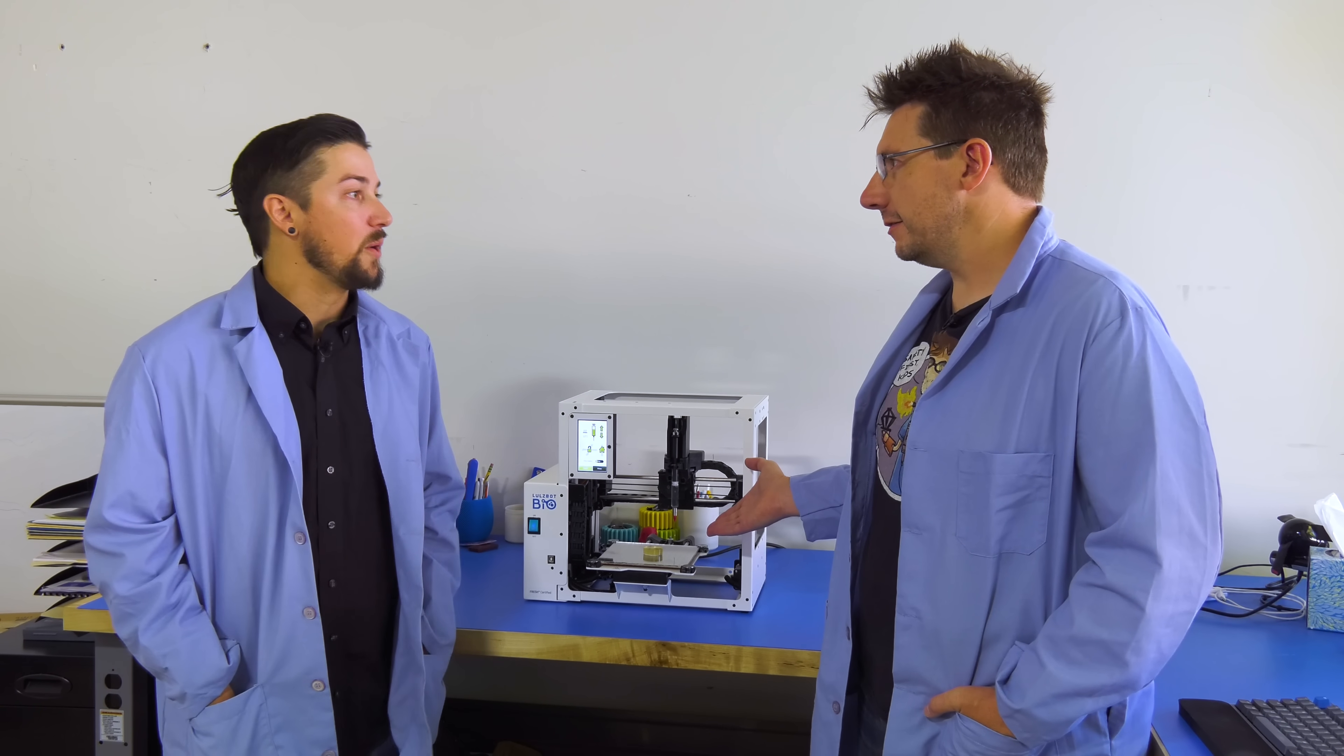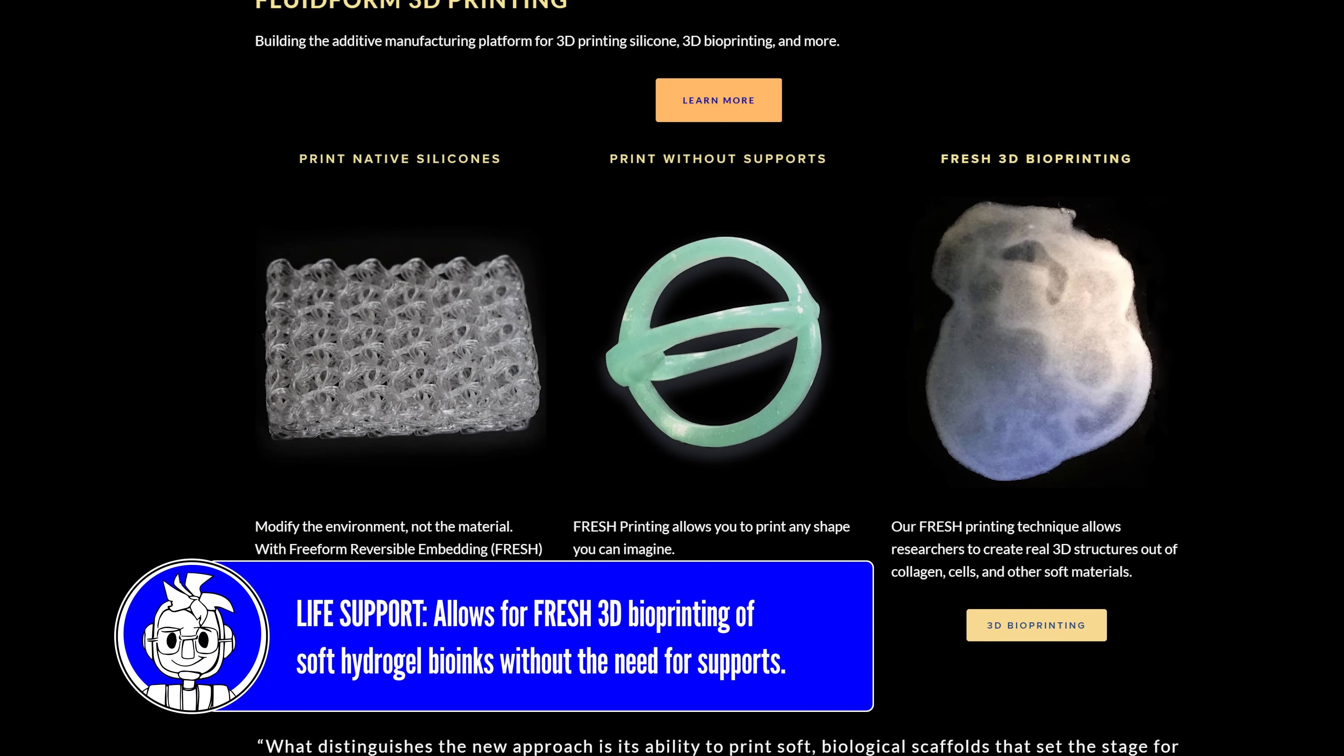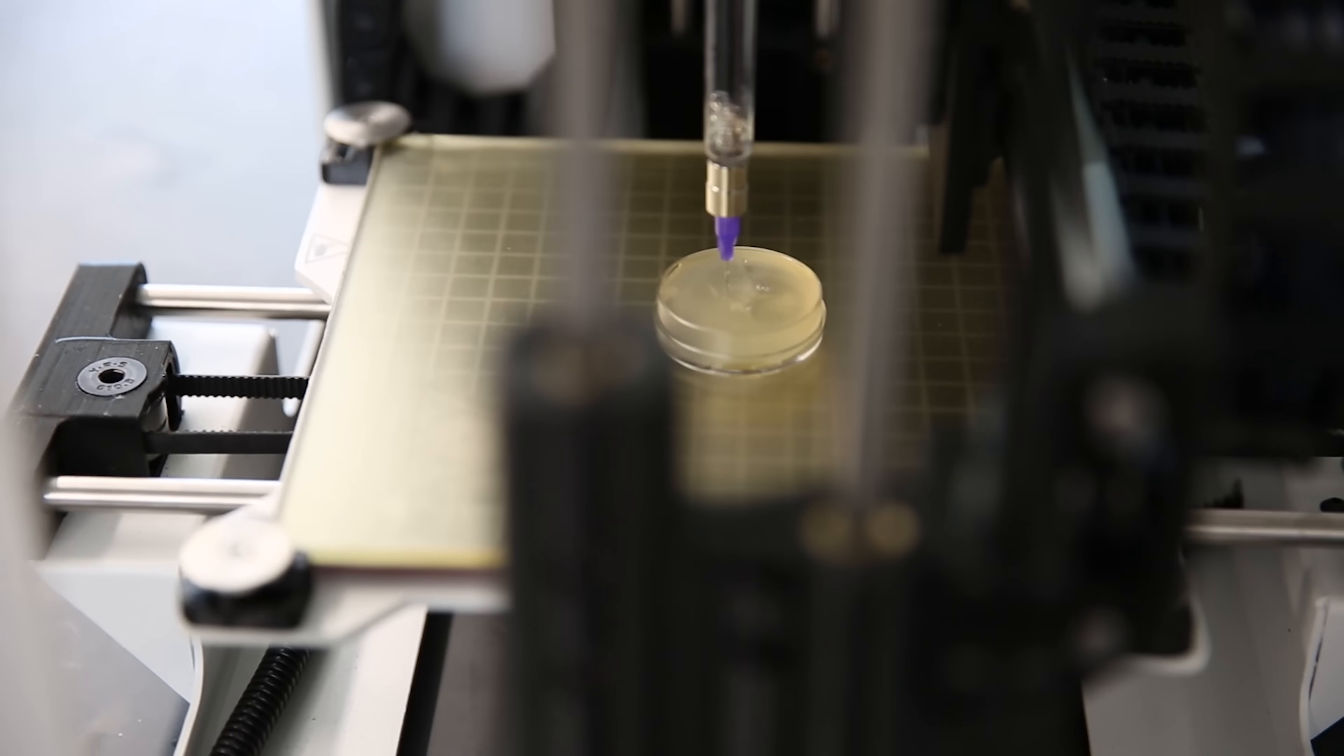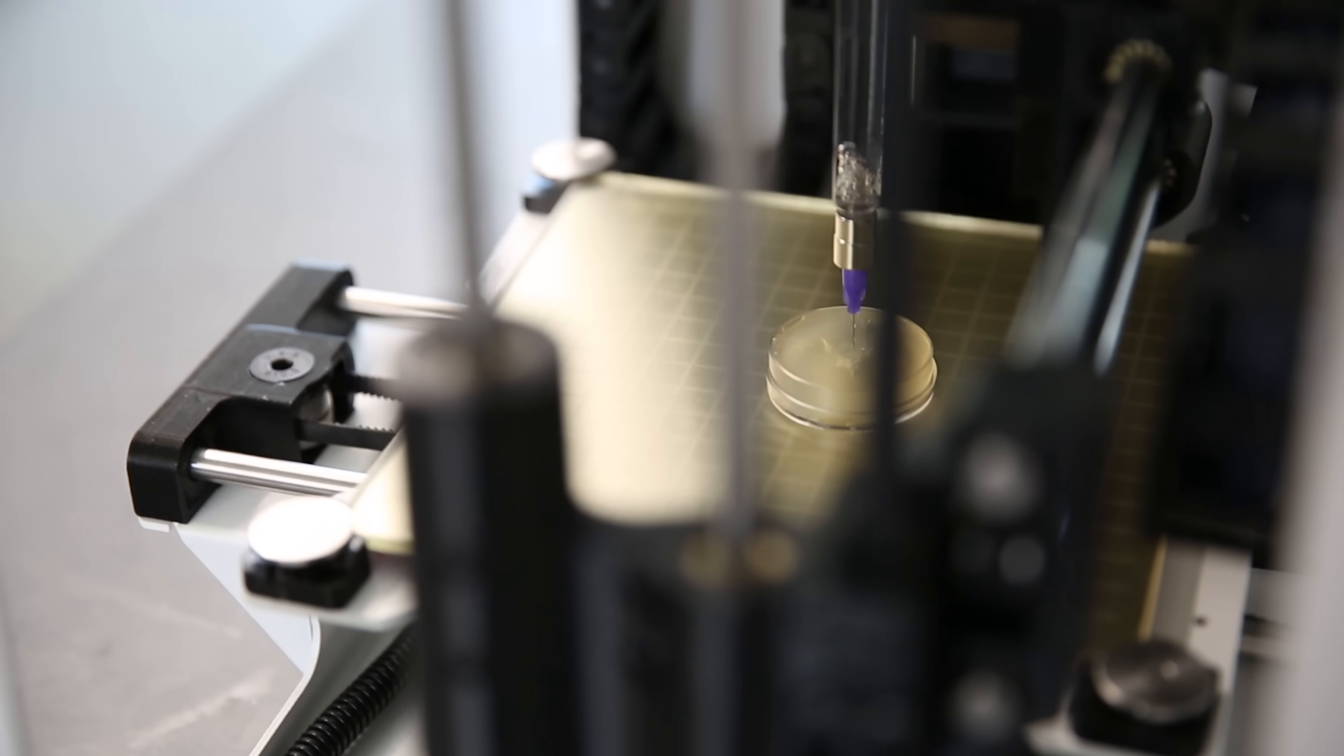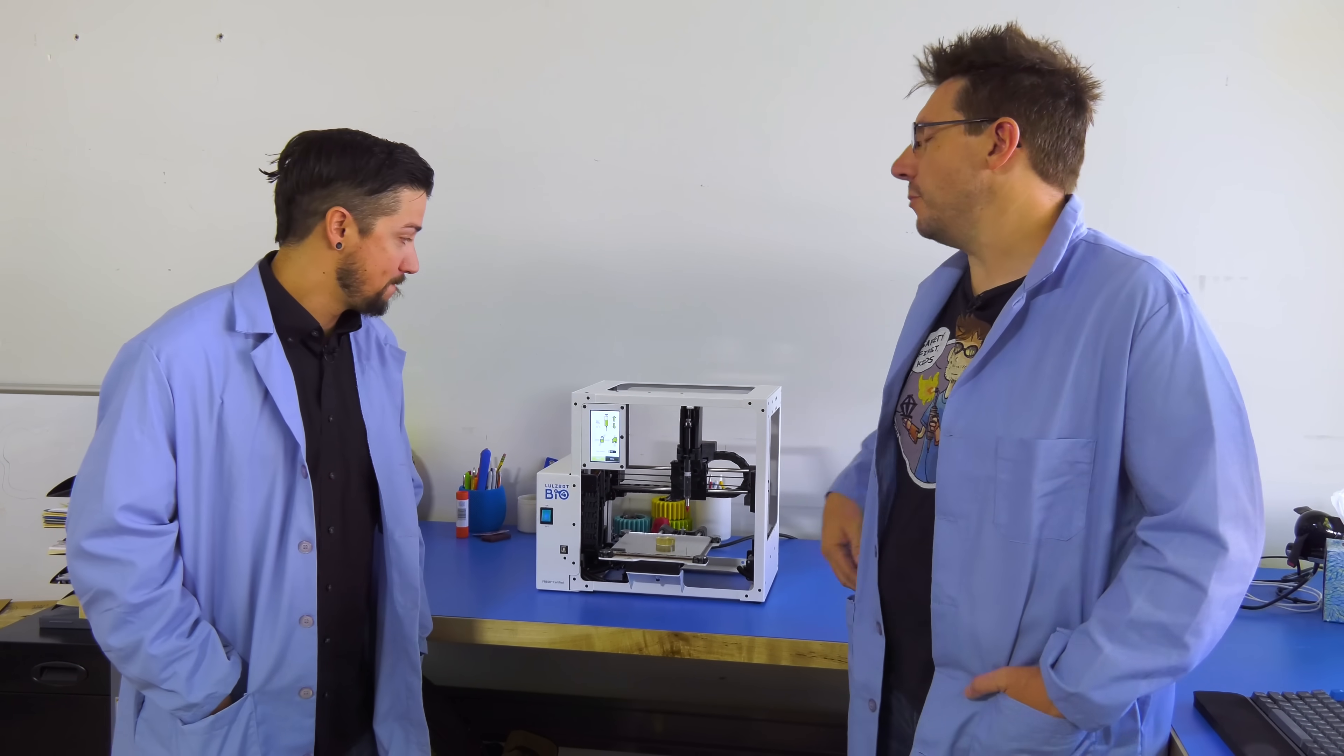So by gel, we're not talking about Jell-O. This isn't cherry-flavored, right? No. This is actually life support from the company Fluidform. It was based on research coming out of Carnegie Mellon University. That's fantastic. And so that life support, that FRESH certified process, allows the printing of different types of soft materials from this syringe? Yes. This is a syringe pump extruder, and basically it can print anything that is a soft kind of fluid material. Meaning cells, meaning, I don't know, frosting? What all is meant to be put through that, do you think?